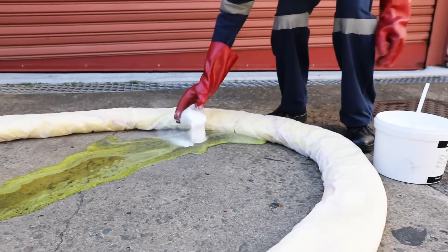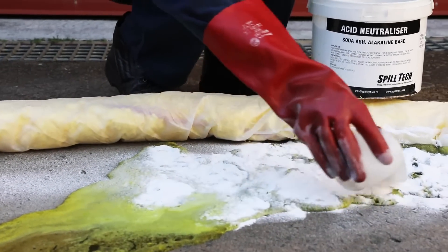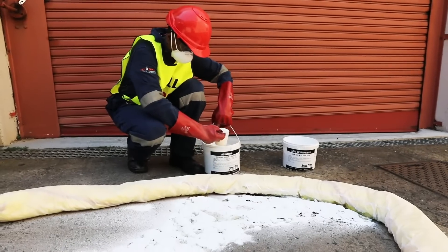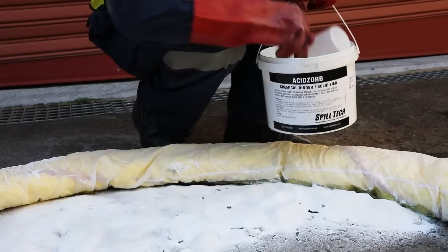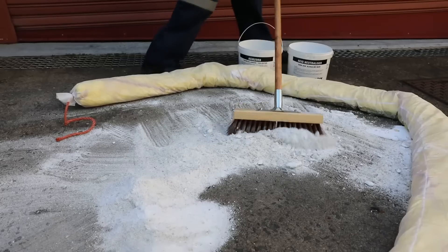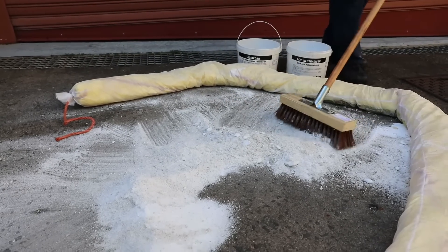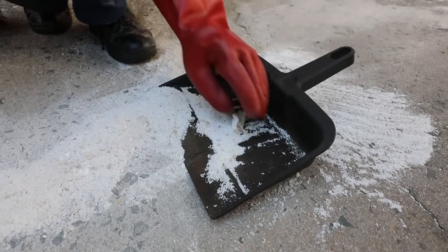If you are dealing with sulfuric acid or nitric acid, first add an acid neutralizer to neutralize the pH level. Then add the solidifier. Adding a solidifier to spilt liquid transforms it into a solid or semi-solid mass, which makes it easier to contain and clean up.